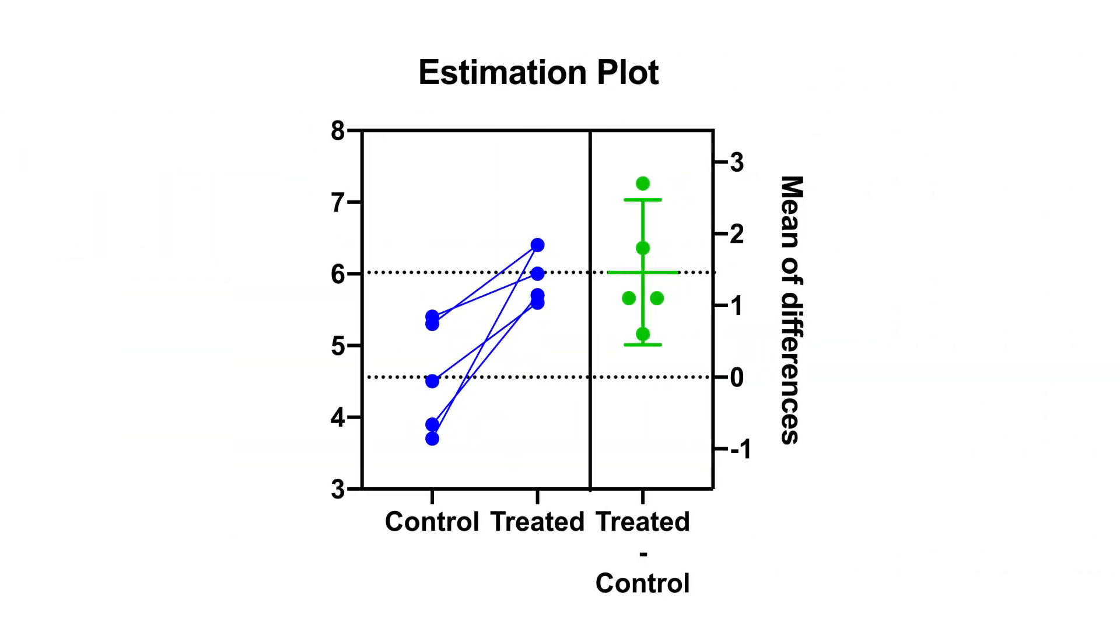Another important graphical addition is the estimation plot, which is automatically generated after both paired and unpaired t-tests. With this graph, the raw data from both groups are plotted on the left y-axis. On the right y-axis, the difference of the group means is plotted, along with its 95% confidence interval.